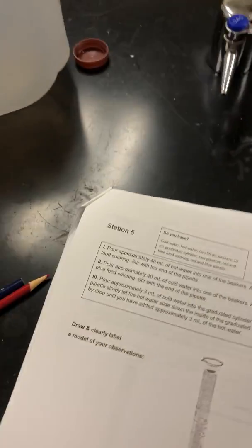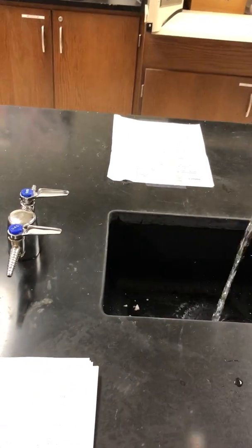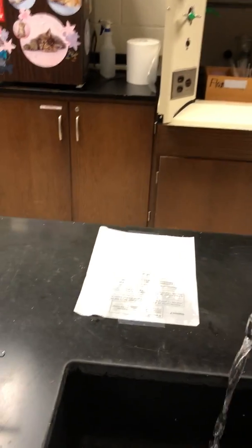All right, moving on. Station 5. Oh, guys, this is like one of the best. Okay, this is so much fun. All right, so we need 40 mils of hot water. I already poured out my hot water, so I'm just gonna put this in the microwave. That works. Because, sorry, I'm getting my 40 mils. Okay, it says approximate, so don't stress. We know microwaves make things hot, so here we go.